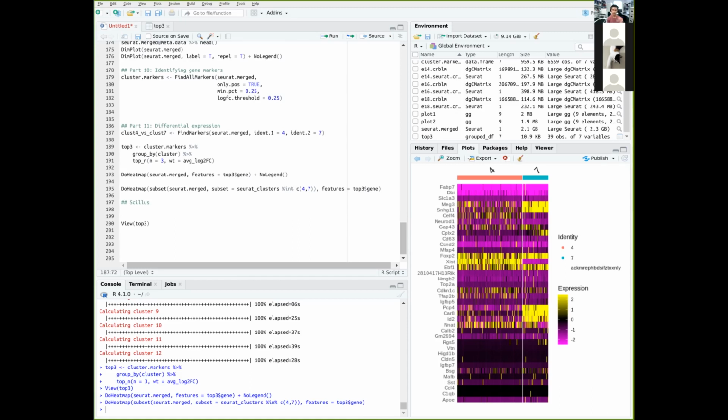It looks a bit different, but essentially the idea is the same. You go through the same QC, the same normalization and stuff, so you can get a more refined data set for single-cell ATAC-seq. There are other tools that you can also use. Monocle 3, I'm pretty sure some of you are familiar with this. It does nice trajectory analysis.